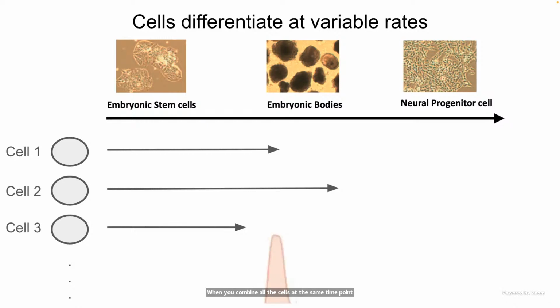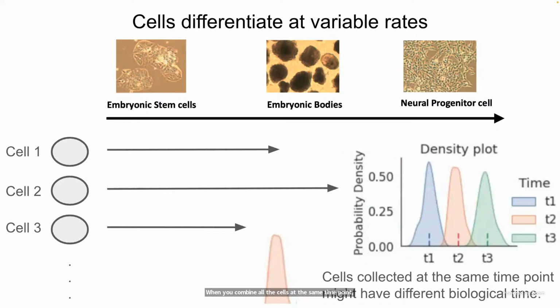you might see a unimodal distribution. And when you have a time series single-cell sequencing data set, you might have a multimodal pseudotime distribution. The goal of our project is to infer the pseudotime for this kind of time series sequencing data set. The microscopy image comes from the Bonora et al. Genome Biology paper.